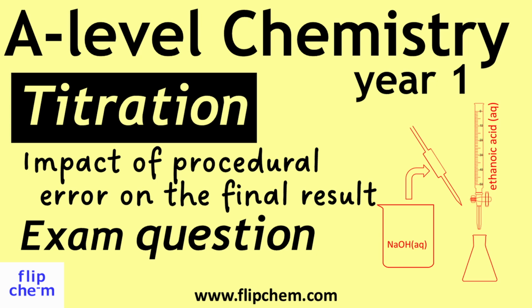Welcome everyone. If you are studying A-level chemistry, you should be aware of titrations. This is a method used to determine an unknown amount of substance. The procedure involves volumetric glassware such as burettes and pipettes. Analysts must use this apparatus correctly in order to ensure that the results are as accurate as possible. In this video, we will look at how mistakes made by an analyst can impact the final results.